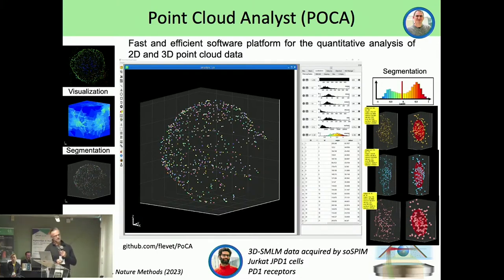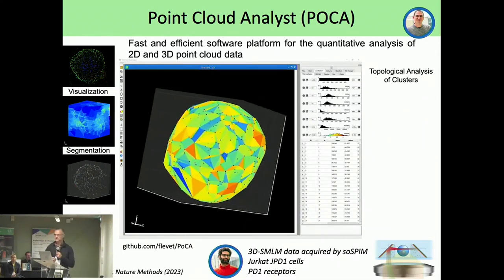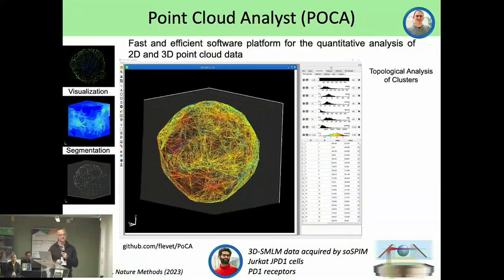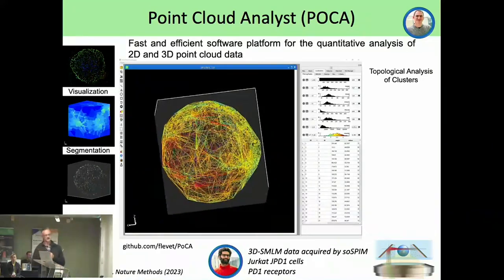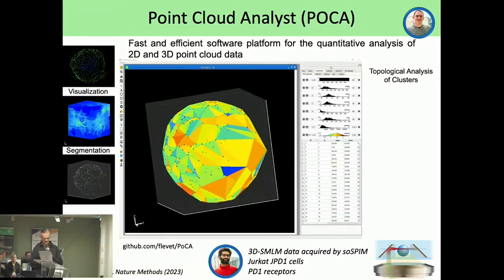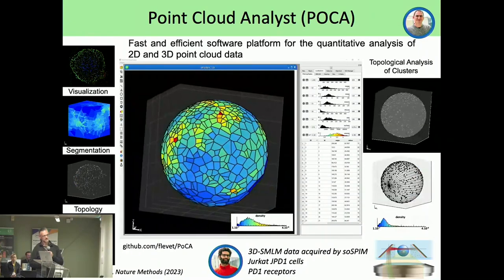And here, this is just the distribution of your clusters now, which you can use the same regular analysis to analyze how much they are organized at the surface. So here, this is easy. This is like a sphere. This is all the type of visualization you can make to understand and also to quantify. So this is a surface mapping on a sphere.